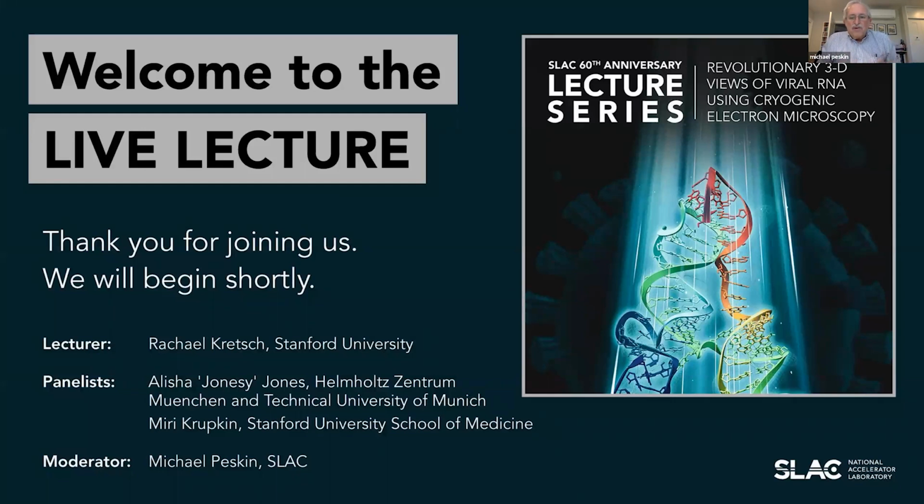So with no further ado, I introduce Rachael Kretsch, and she's going to tell you about revolutionary 3D views of viral RNA. So please. Great. Thank you, Michael. So as Michael said, I'm Rachael, and I'm going to be telling you guys today about RNAs, their structure, and how we study it with Cryogenic Electron Microscopy, or as we call it, Cryo-EM.